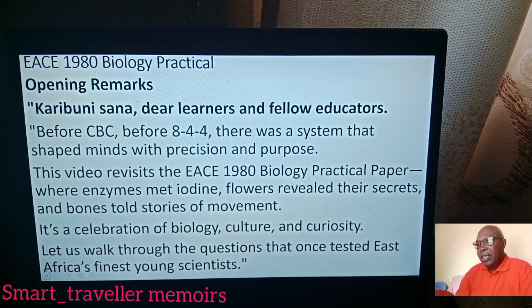Before CBC, before 8-4-4, there was a system that shaped minds with precision and purpose. This video revisits the EACE 1980 biology practical paper, where enzymes meet iodine, flowers revealed their secrets, and bones told stories of movement.